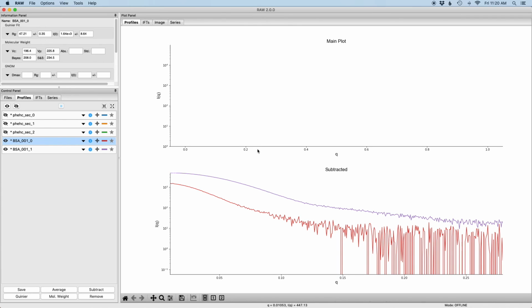You could also use another deconvolution method to see if you get the same thing, or do something like AUC again to verify the molecular weights. There's a number of ways to do this, but best practice is to verify whatever you get from EFA against something else.